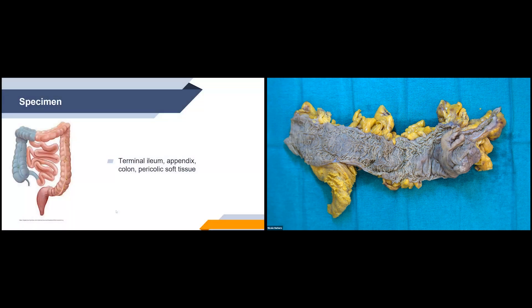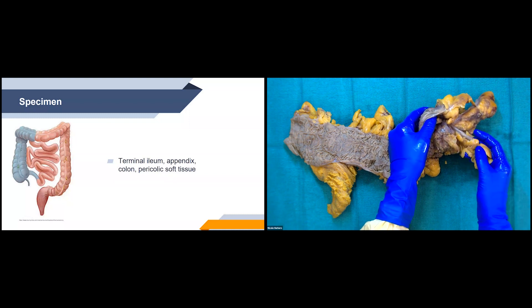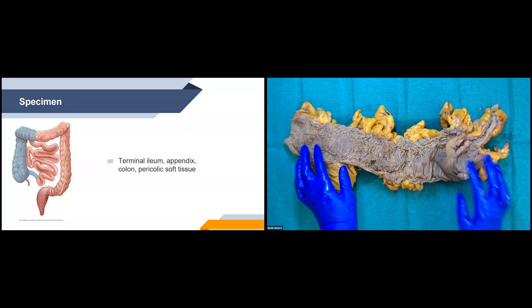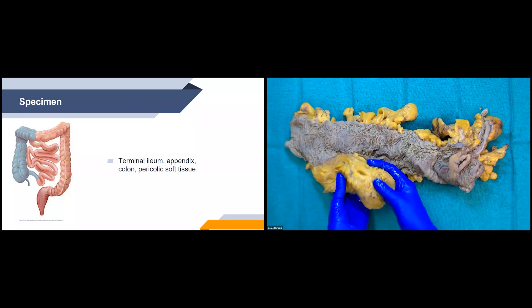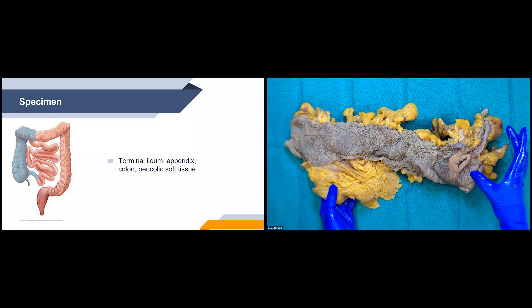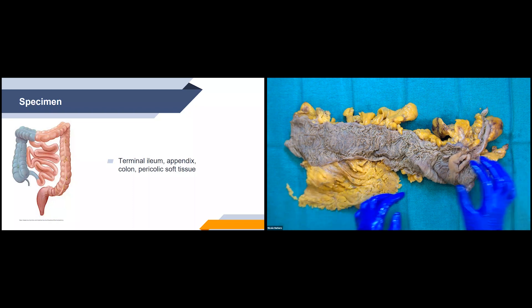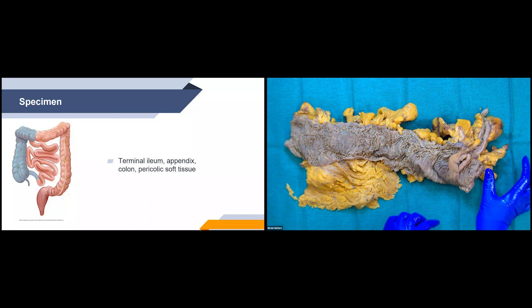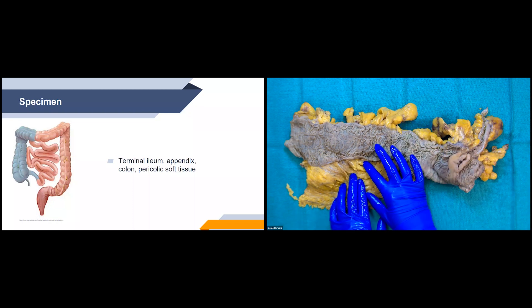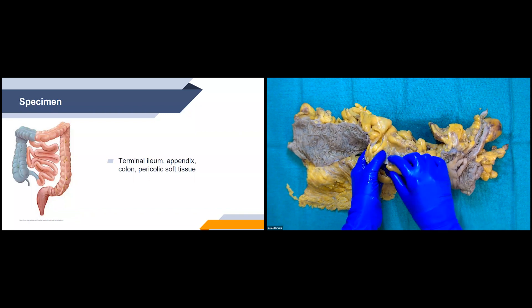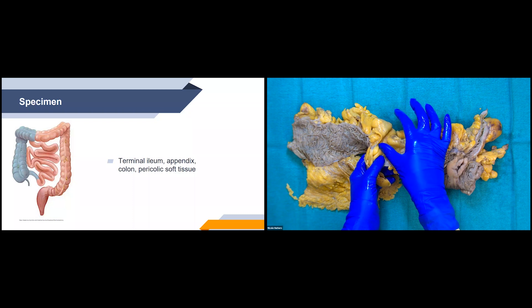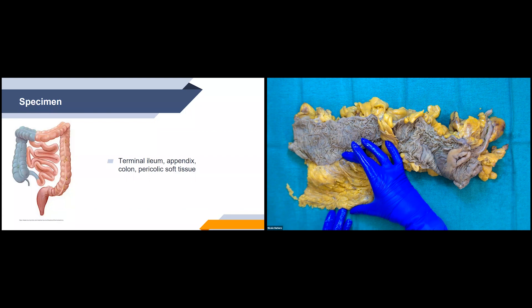The specimen includes the terminal ileum, the appendix, the colon, and the pericholic soft tissue. For this one we also have omentum. For the portions of bowel, we'll want to give a measurement in length and also open circumference for each part. For the appendix, we'll give total length and diameter. For the pericholic soft tissue and omentum, we'll give one measurement of greatest depth — measured from where it's inserting onto the bowel to where the surgeon had to resect.